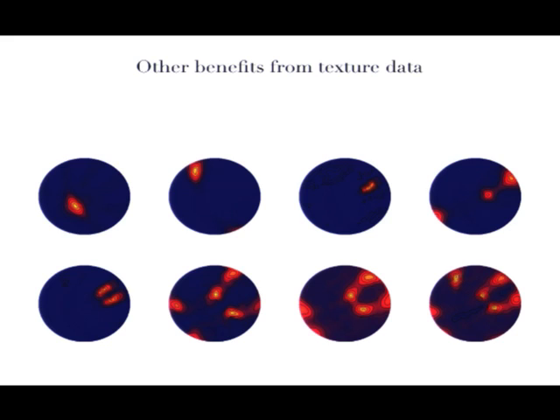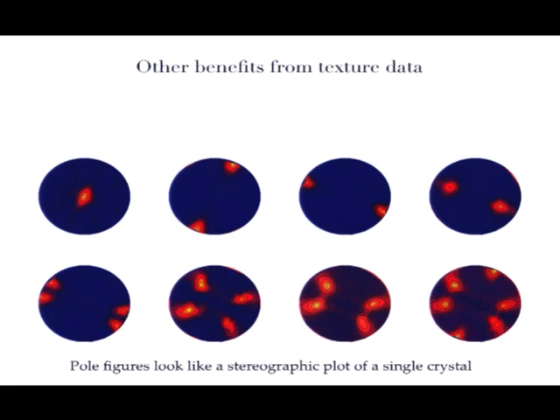Now it's sort of randomly oriented, so we will move this to see it better. We will move this peak into the center. And of course, we have to do that for all the other pole figures as well. And it becomes already more symmetrical.